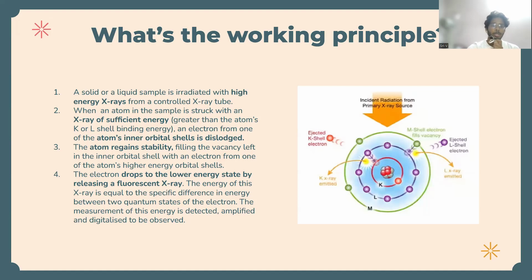It should also be noted that most atoms have several electron orbitals like K, L and M shells. When X-ray energy causes electrons to transfer in and out of these shell levels, XRF peaks with varying intensities are created and will be present in the spectrum.